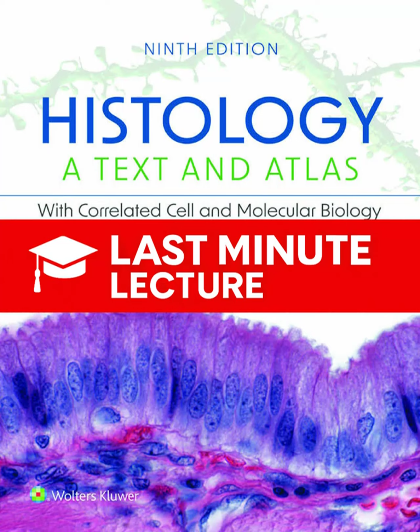And then to the ultimate resolution of electrons and physical probing with TEM, SEM, and AFM. And we tracked the convergence of these fields with techniques like 3DEM and the, I think, ingenious simplicity of expansion microscopy. The convergence of optics, chemistry, and computation is the major theme. It's what allows us to ask and answer biological questions with a resolution that was just unimaginable even a decade ago.